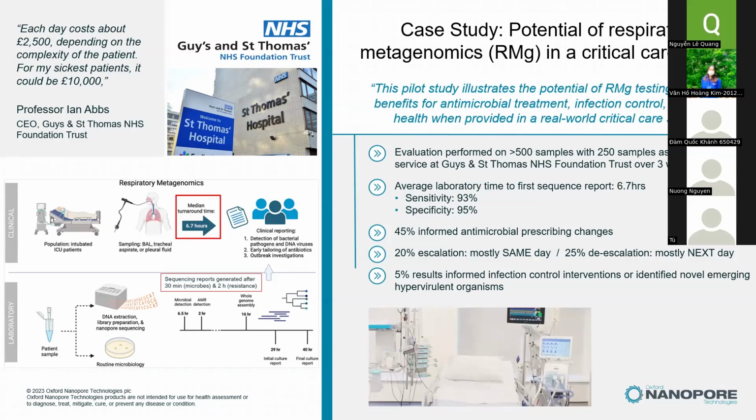Indeed, if it's a real-time analysis, because we have different workflows or tools that you can select, with real-time analysis the accuracy is lower.